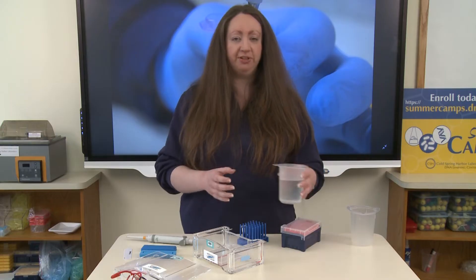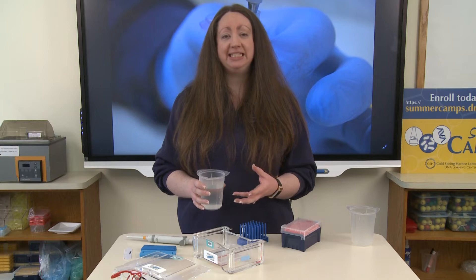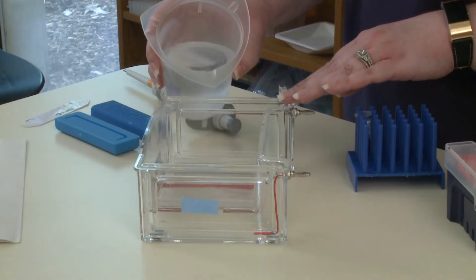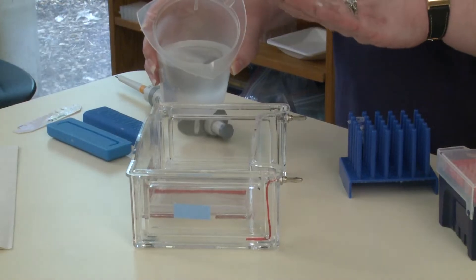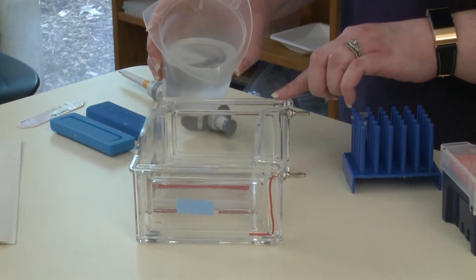I have our buffer. This buffer is TBE buffer, so it's a mix of tris-base, boric acid, and EDTA. That will again help us to mobilize the DNA to move through. You're going to pour the buffer into your gel box, and you're going to put just enough buffer in here to fully submerge the gel itself, but you don't have to fully submerge the casting tray.